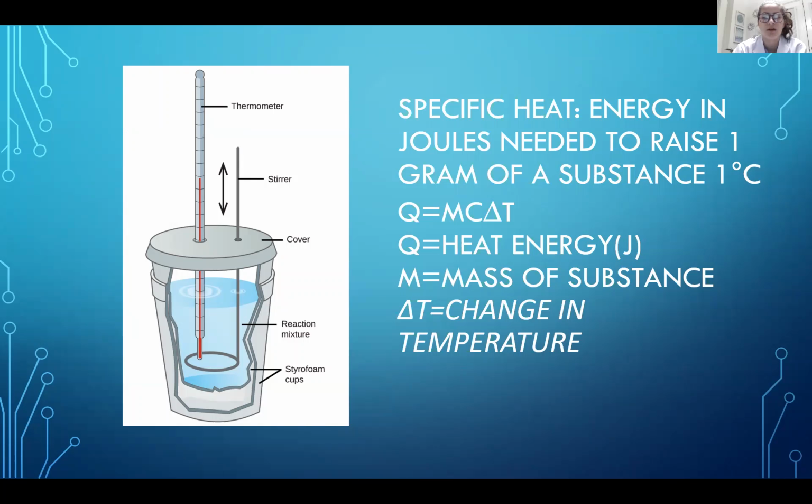The use of water is very important in this experiment because by using the specific heat of water, we can discover the energy that was used to raise or lower the temperature of water in the calorimeter. This is possible because the constant pressure enclosed system provided by the calorimeter allows us to assume the temperature changes of the water was a direct result of the chemical reaction taking place.